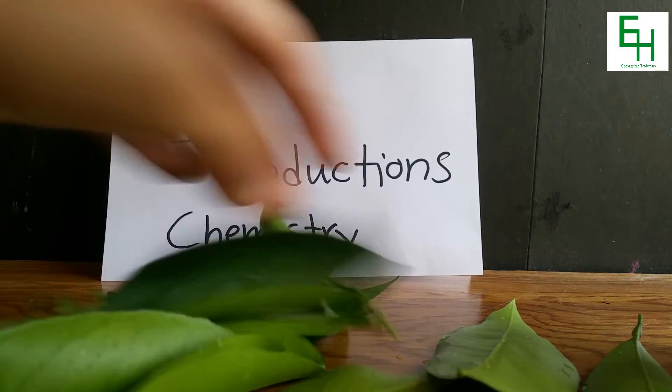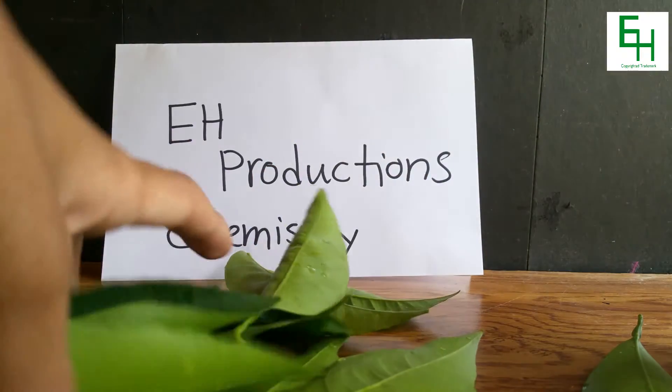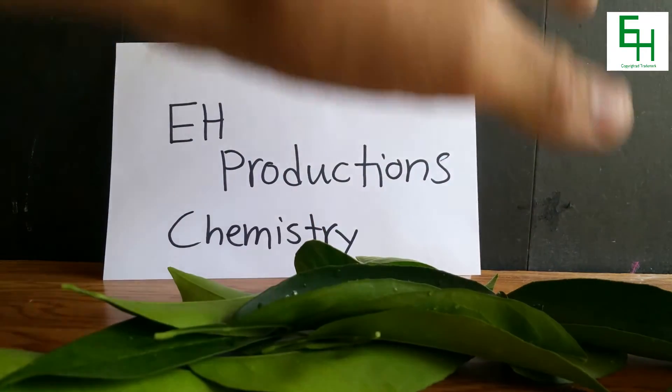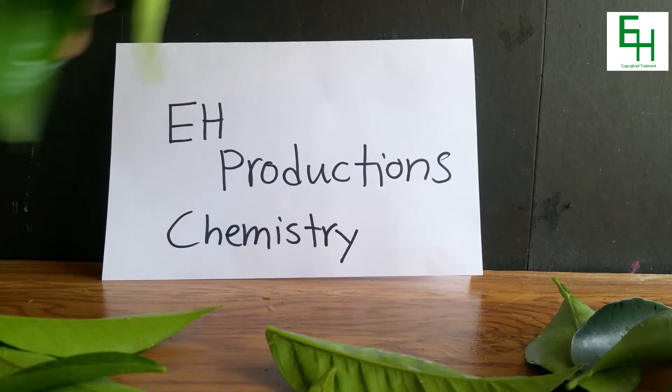Here I have about 15 leaves. So what you want to do is make sure to wash the leaves and make them clean. We don't want any dirt or dust on top of the leaves.